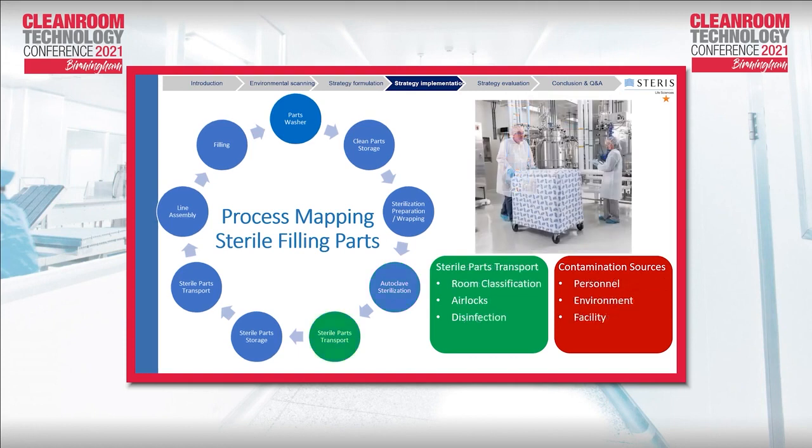Now you understand the process. So the goal is, after sterilizing the part, to transport the sterile part to your aseptic area. Again, here it will be to make sure that the room classification is adequately controlled, airlock transfer between airlocks, and transfer from a grade to a higher grade, that the disinfection is performed adequately. Source of contamination, again, the same type.